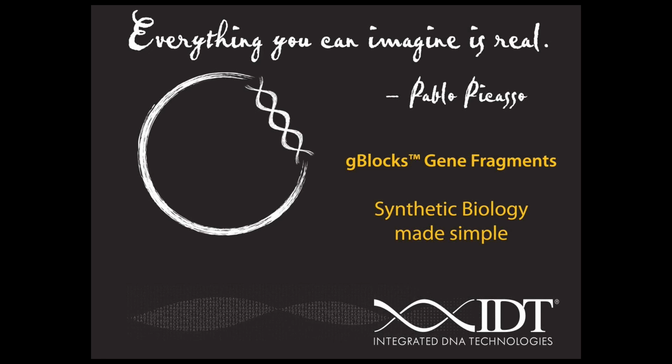Part of it depends on how the Gibson assembly method is designed, and we can certainly help design things in a way that is going to maximize the chance of it working. Certainly, the customer could order that as multiple gBlocks, and as long as those had unique regions where the overlaps are going to lie for Gibson assembly, they could assemble that. And there's a fairly good chance of success.